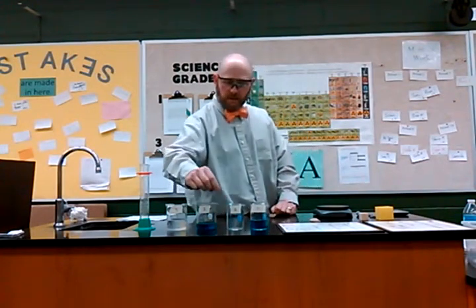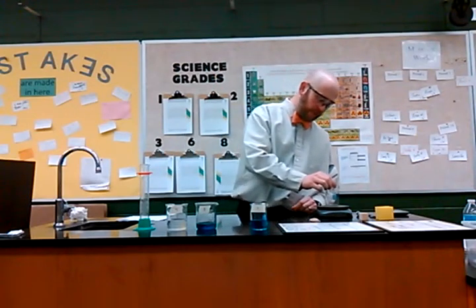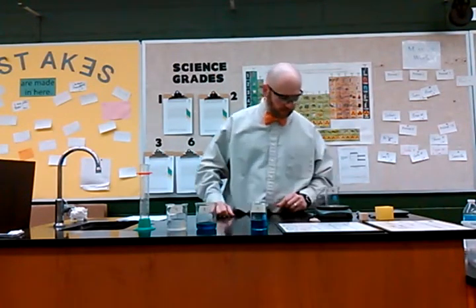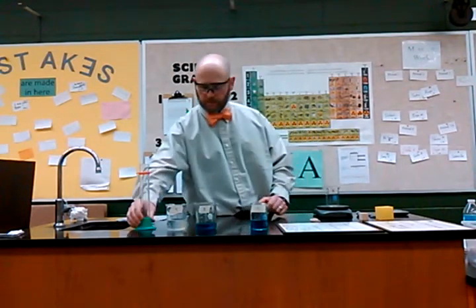Next on my list is the water and salt mixture. I will place beaker 2 on the scale. Beaker 2 weighs 64 grams.